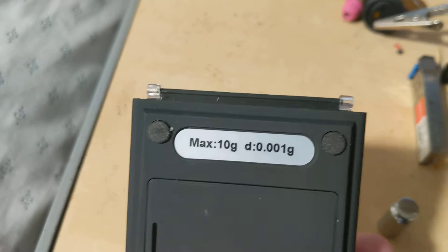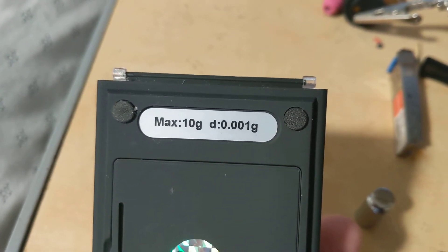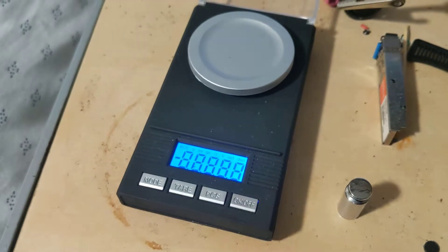There you go — 10 grams, and the display is 0.001 gram resolution. Put some fresh batteries in it and fire the little booger up.